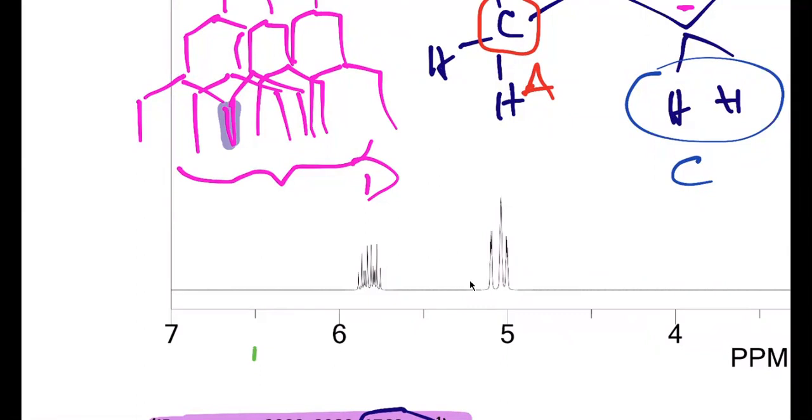So if we only see 10 lines here for this signal, that means that two of those lines in that splitting tree probably overlap to give you just one signal. Are you following that? Yeah, so do we count the lines of the last part? That's what I'm saying. Like, do I count lines starting from the triplet down, or we just count the bottom?